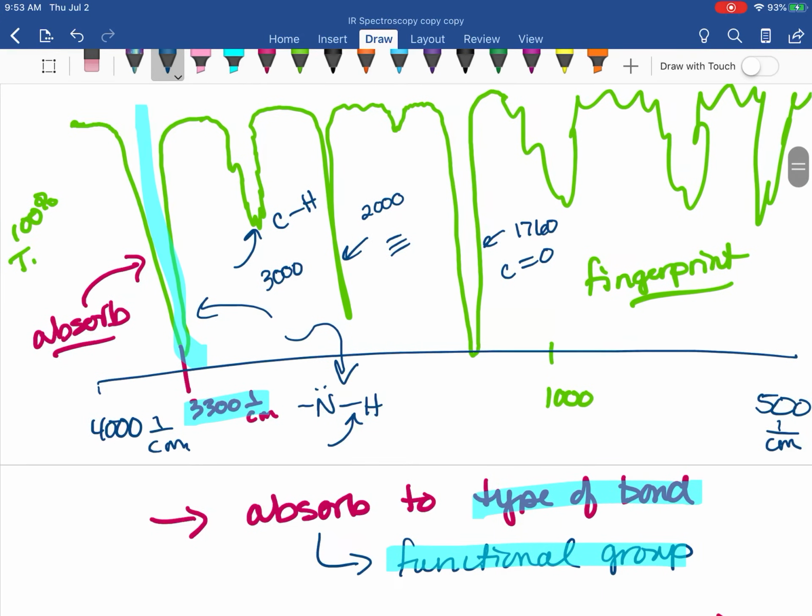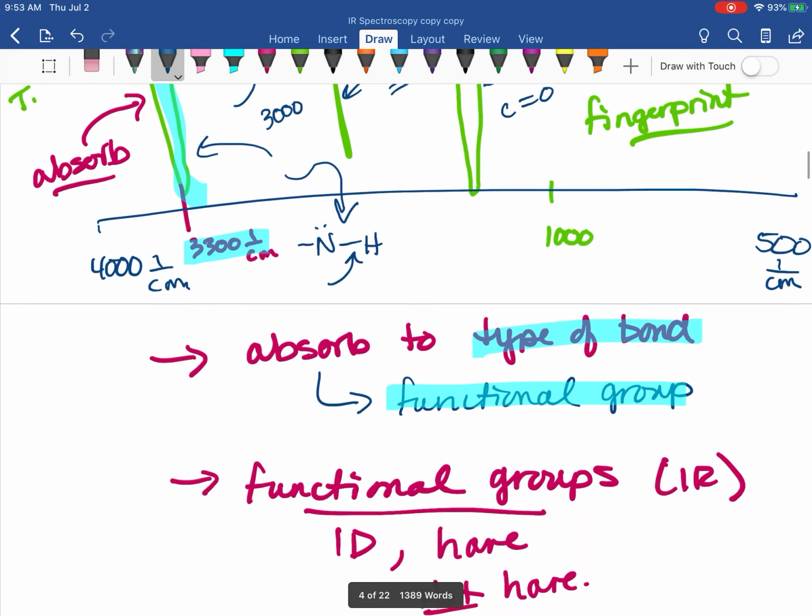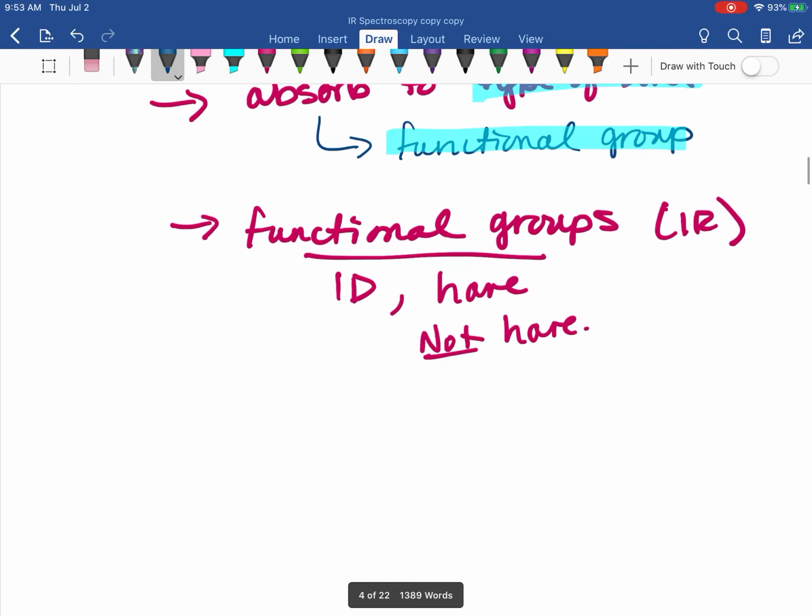Welcome back, Organic Chemistry. Let's take a look at our spectroscopy again. I love it. Okay, we ended with a basic idea of what IR spectroscopy would look like. And now let's take a little bit to actually talk about how that works and how we can read that.